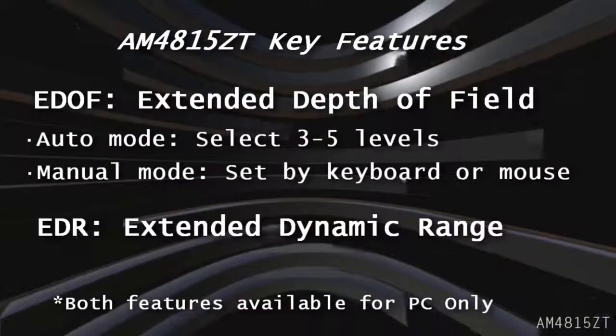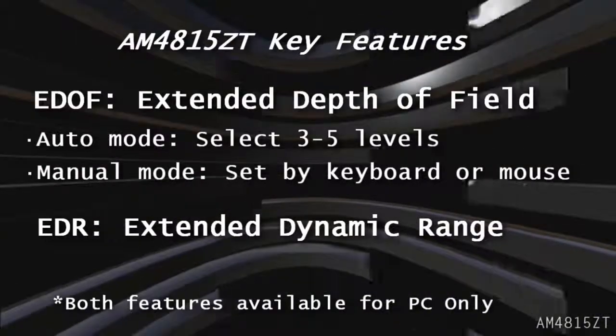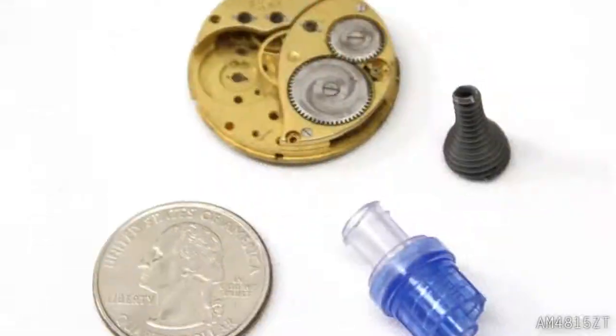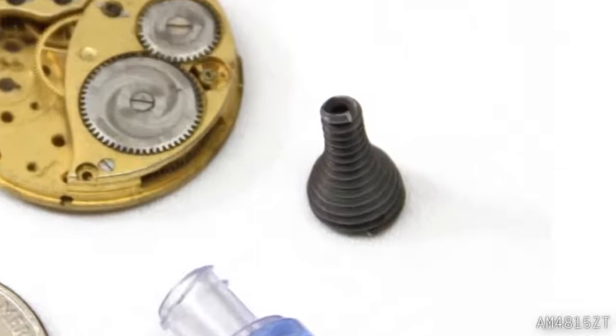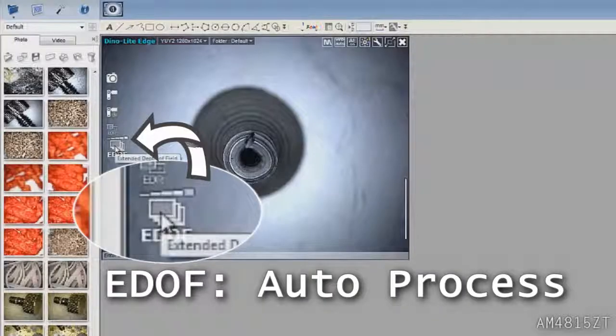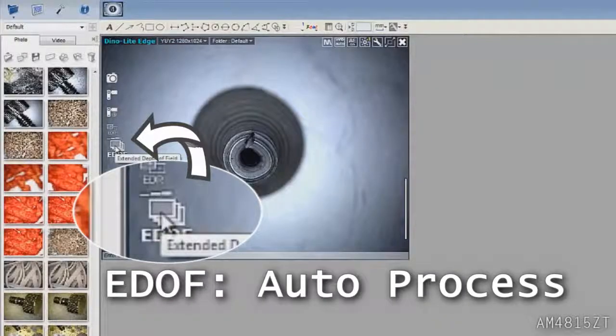To use the Extended Depth of Field or EDOF in Auto Mode, simply click the EDOF button.